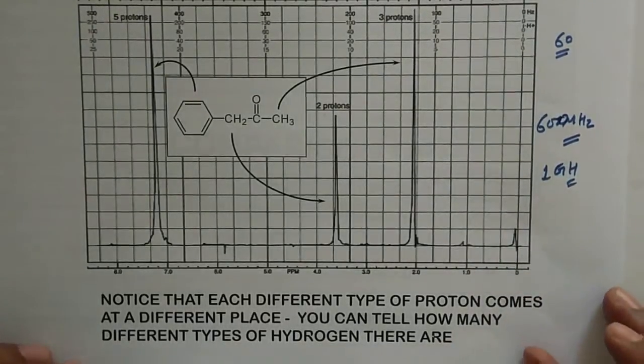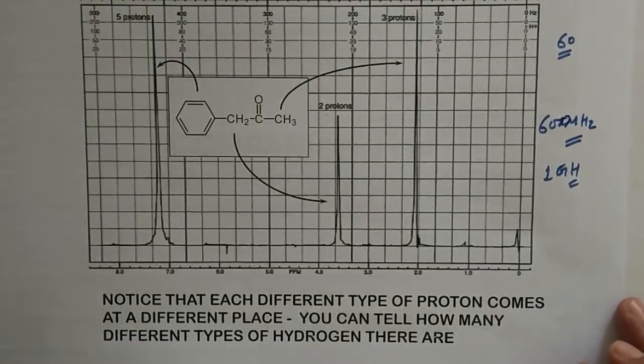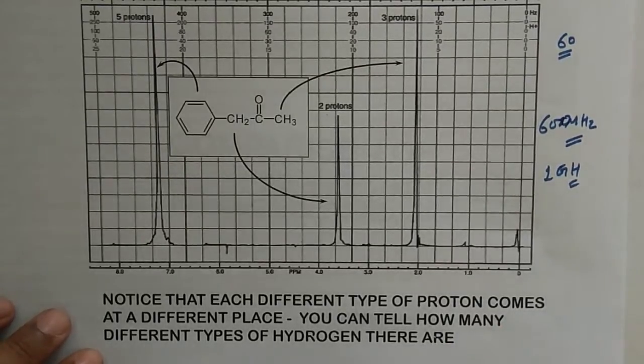And if you can recall the sensitivity of NMR spectroscopy, which I explained in my earlier lecture, if you increase the magnetic field, then you have better sensitivity, because on increasing the magnetic field, we have a higher excess population in the alpha spin state, which I explained in my earlier lecture.